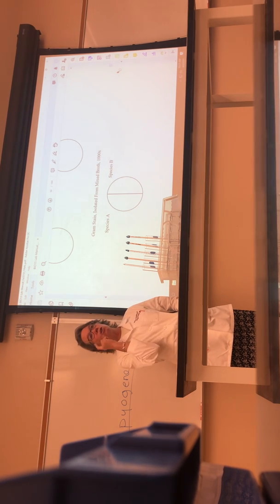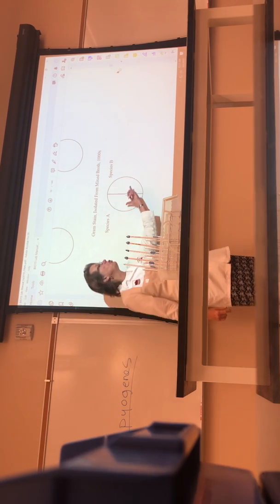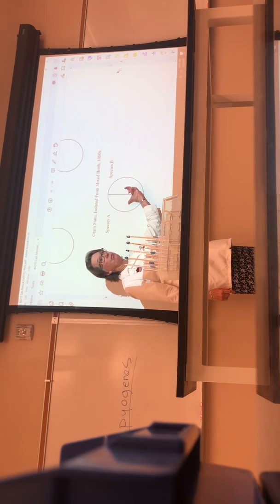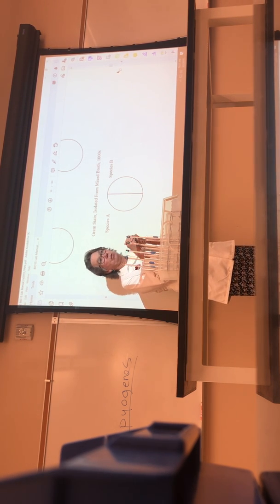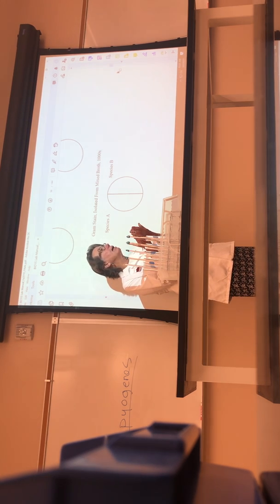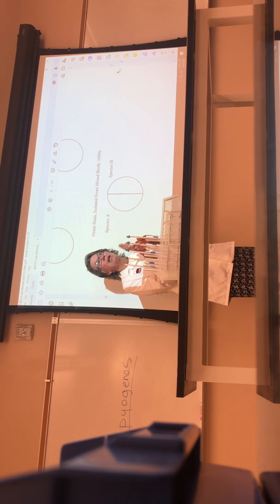So all of you should have one slant that says your unknown number and that it came from the McConkey. You know now that that is whichever of these two species was gram negative, because if it grew on McConkey, it has to be gram negative. Okay? So I believe all groups had growth on McConkey, and you put it onto a slant, that is your gram negative. You should have that slant.